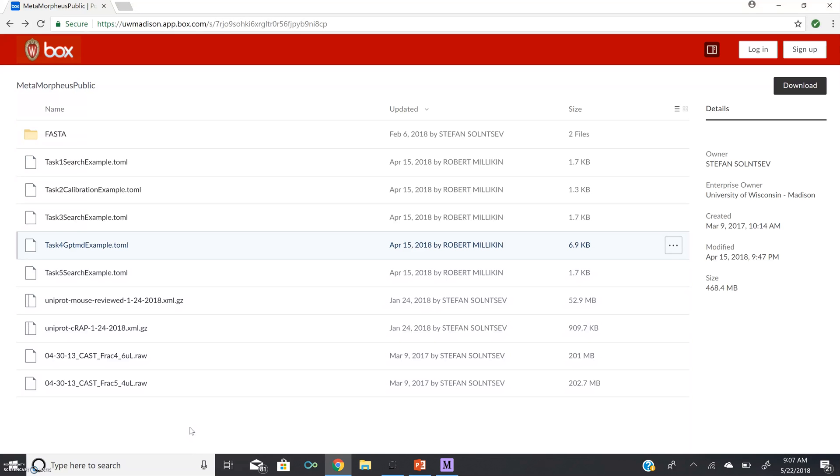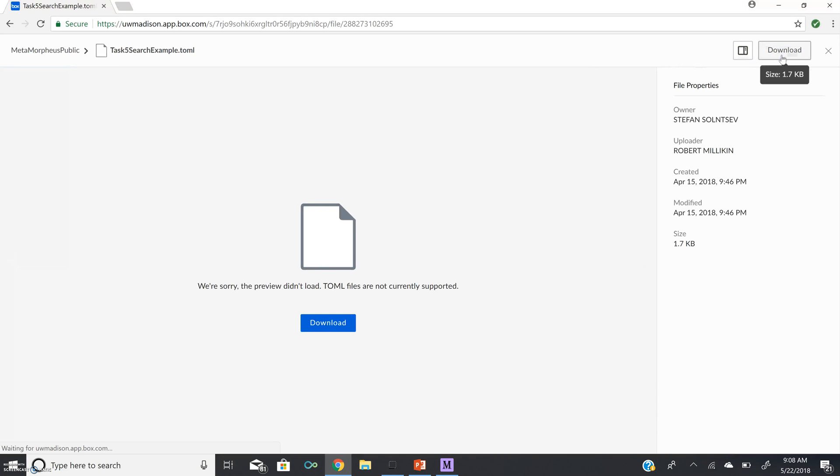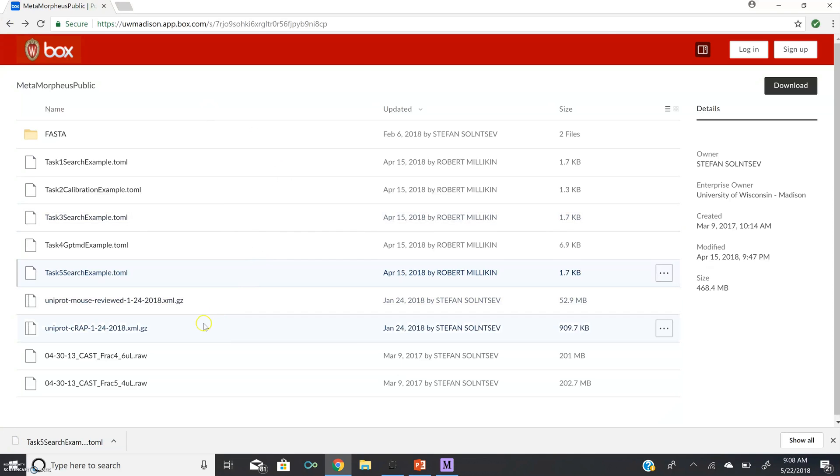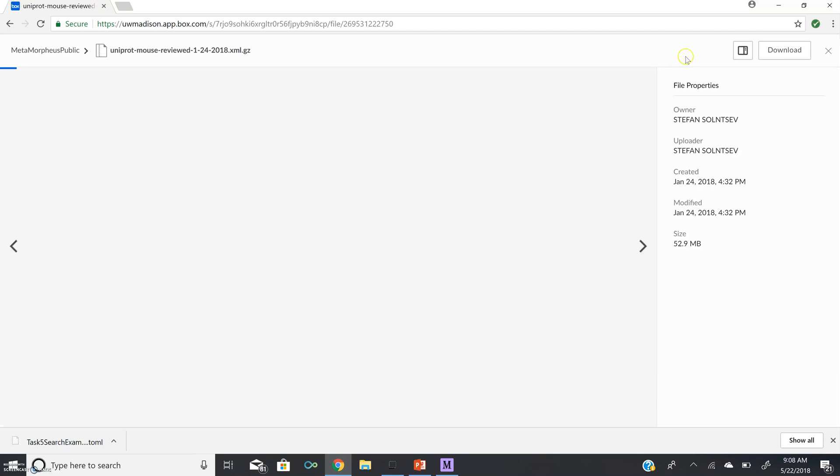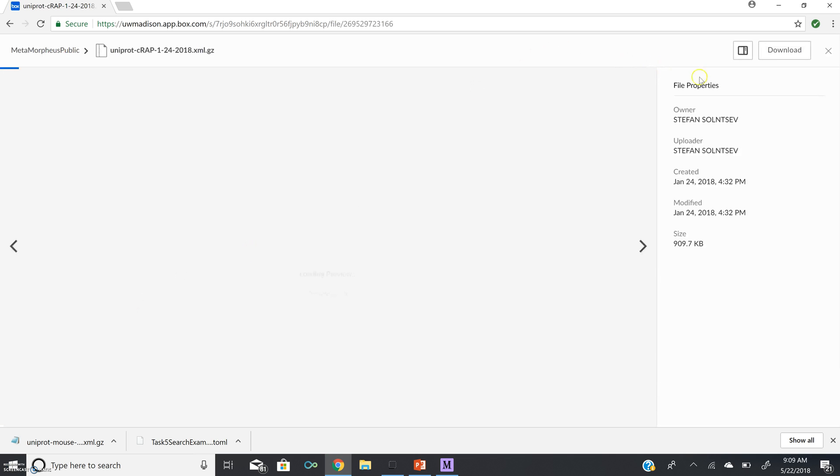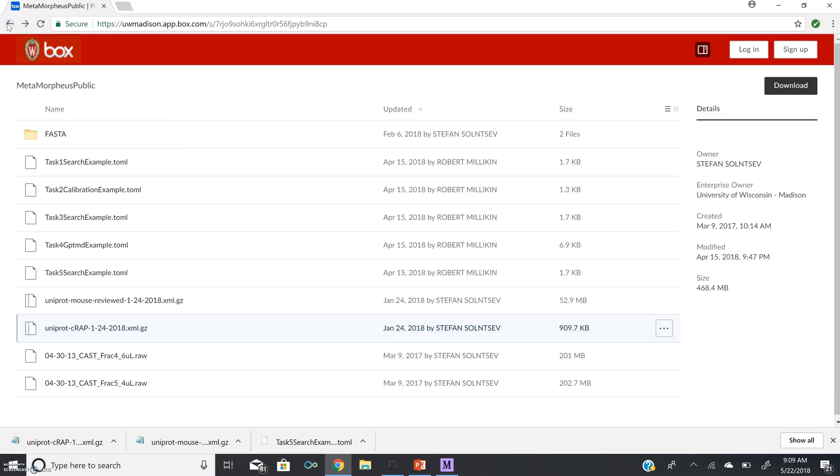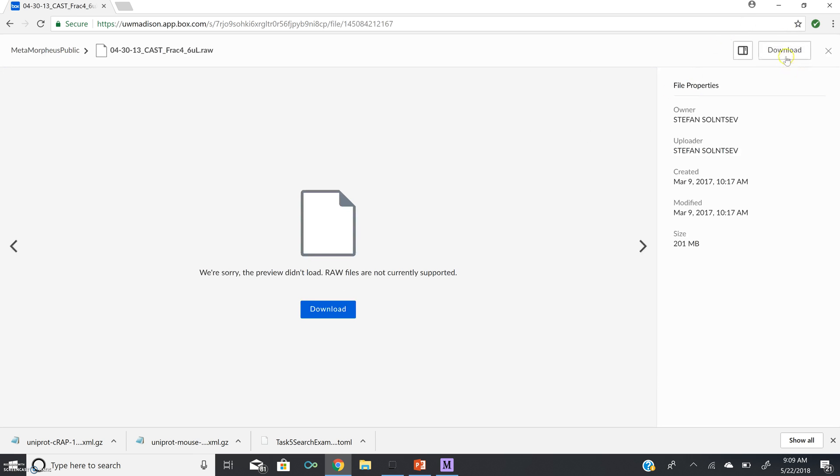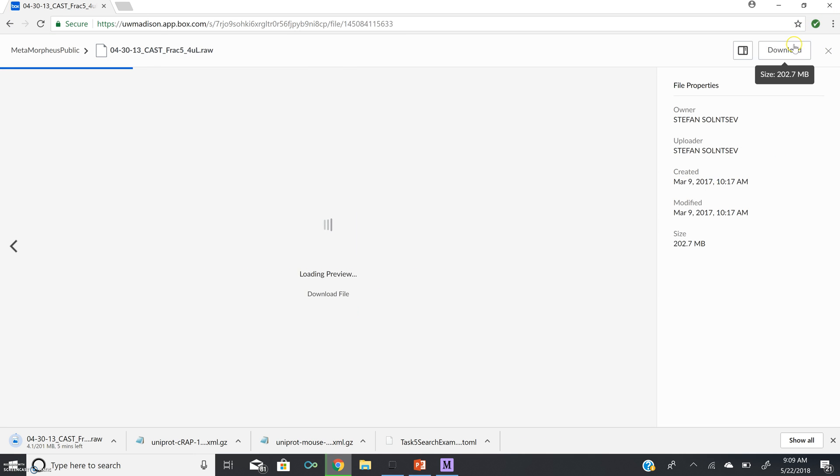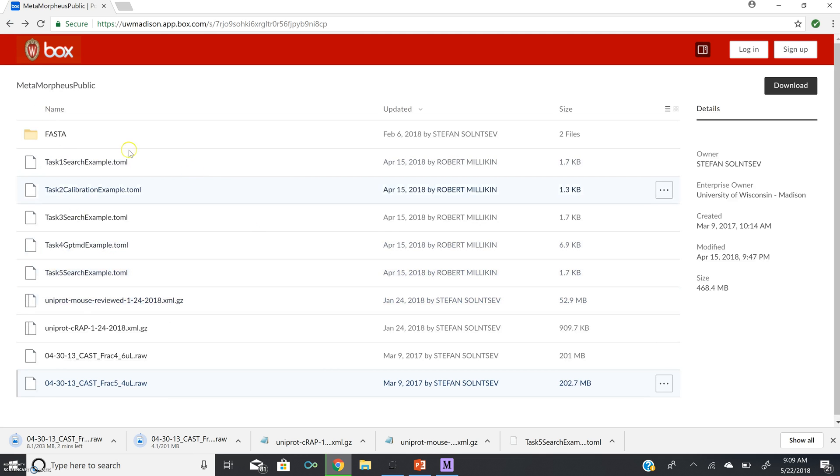The final task we are going to download is the final search task. Next, we are going to download databases to search against. So the first is a Uniprot mouse database. Next, we are going to download a Uniprot contaminant database. And then we are going to download some example ThermoRAW files. Now we have downloaded all of our example files from the vignette.